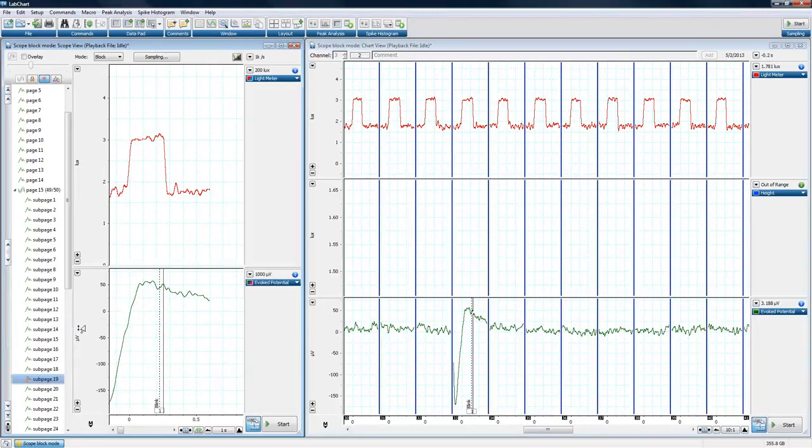It gives me a very, very easy way of looking through these events, and I can look at them in the chart view, see if there's something wrong with them. I can click on them, go directly to that page, I know exactly where that page is, and I can right-click on it and exclude that from the average. It's a great, useful tool.